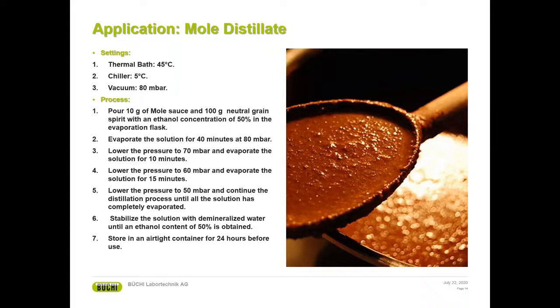As always, the process is very simple to follow, but can vary according to the solvent you are using. So in this case, obviously, we're using ethanol, but if you're using water, just keep in mind that you have to adjust the settings based on this, but it can also change based on the molecules you are using.